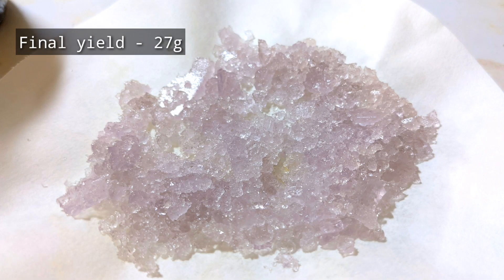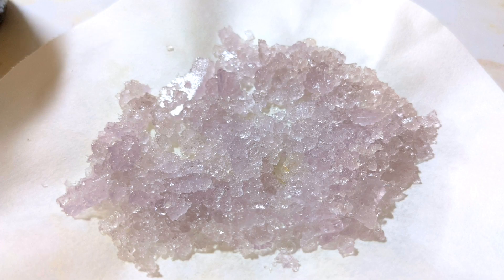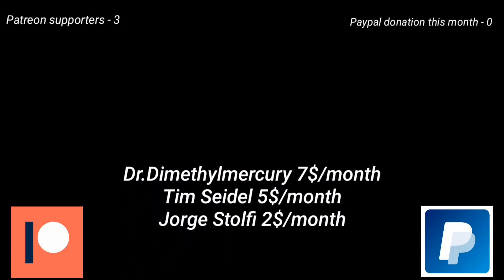The final yield I obtained was 27 grams of pure ammonium iron(III) sulfate. A quick note on storage: this compound does not remain stable if kept exposed to air and it quickly turns brown. Always store it in damp conditions — dip a filter paper in the supernatant solution of the crystals and keep that filter paper in the storage bottle along with the crystals to maintain moisture.